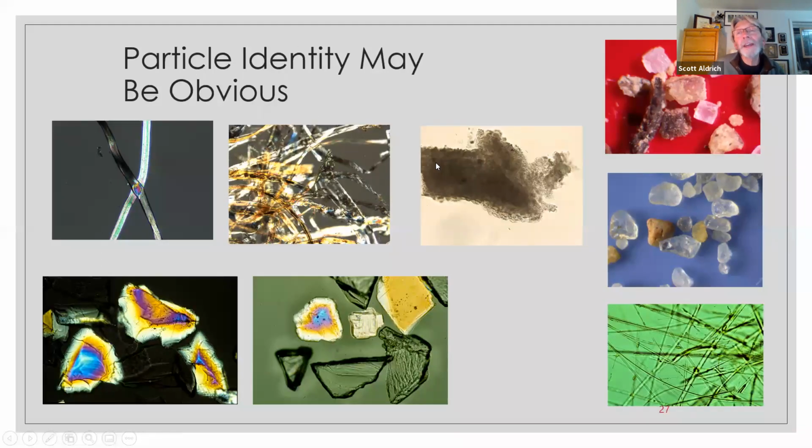And so in this slide, I'm just showing a number of materials here that are almost instantaneously recognizable to the practitioner. Again, you all can tell that's polyester. I just showed it to you, and here's some cardboard. But this is a segment of a closure, a rubber septum, the sealer that goes on top of a pharmaceutical vial.